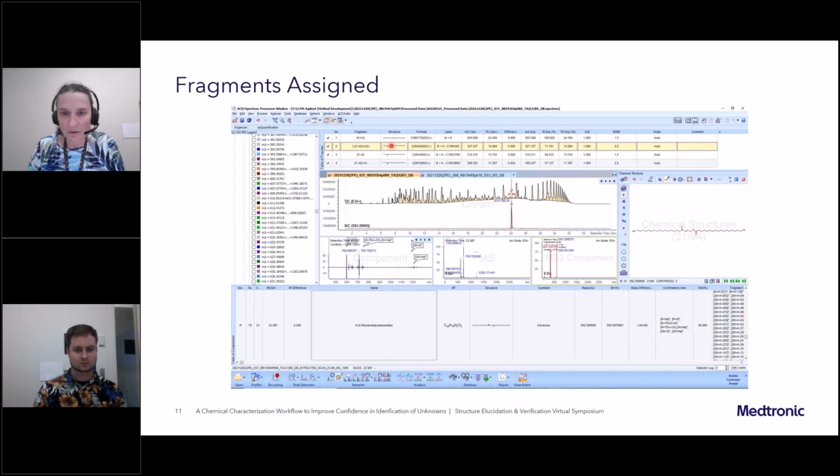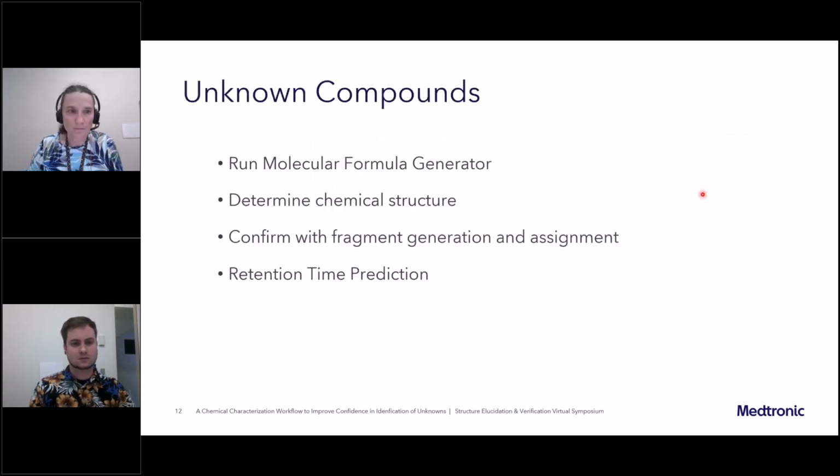And then we conclude by doing this assignment of the MS2 spectra in this window to the actual molecule shown here. And as you click on each of these fragments in their assignment, you will actually see in red here which part is corresponding to each fragment in this window right here. And now I'm going to turn this over to my colleague.